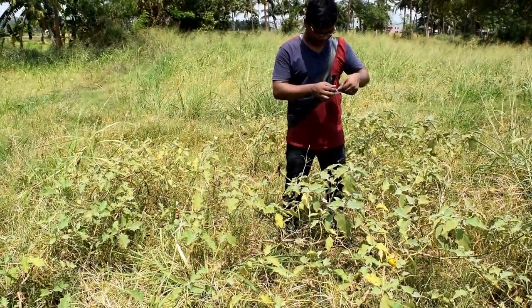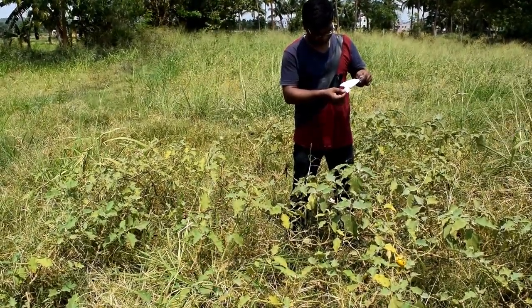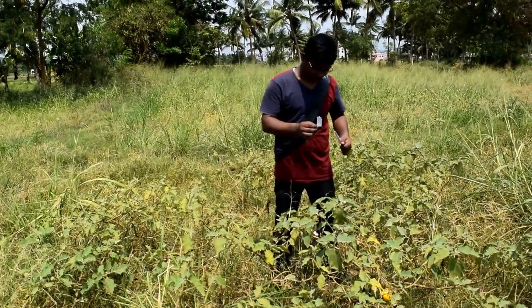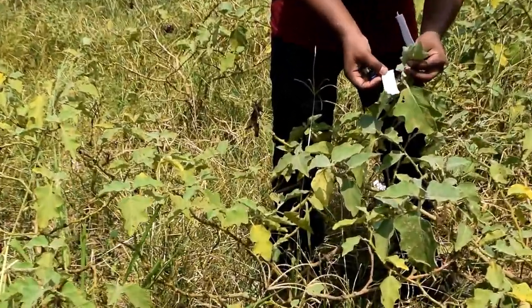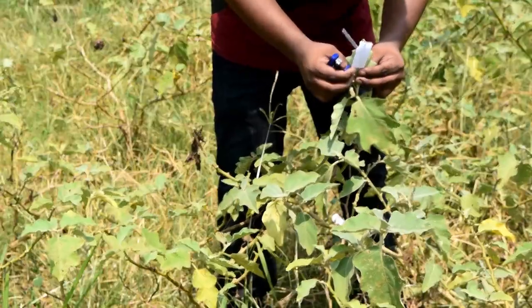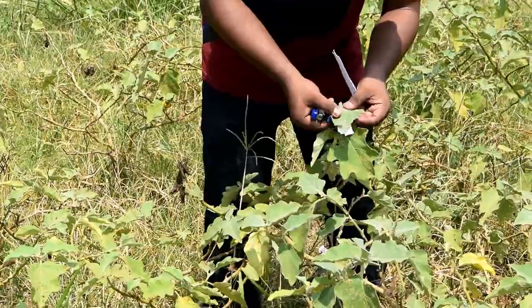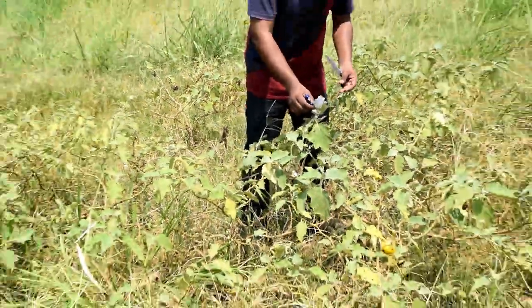Trichogramma adult females emerged from the trichocards search the eggs of the insect pests and lay eggs inside the eggs of the pests. Six applications are required depending on the crops and the insect pests. Trichogramma egg parasitoids are used to control mainly the borer and the leaf-eating insect pests of order Lepidoptera.